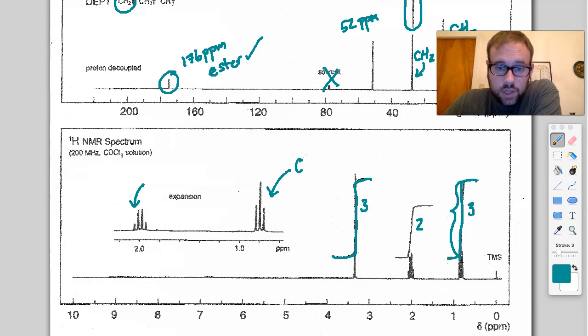So this would be a CH3. And if we take a look at it, a triplet means its neighbor should have two protons. So this is CH3 next to a CH2. And then we would expect that CH2 to be right over here. And that shows up as a quartet, which means we've got a CH3 here.